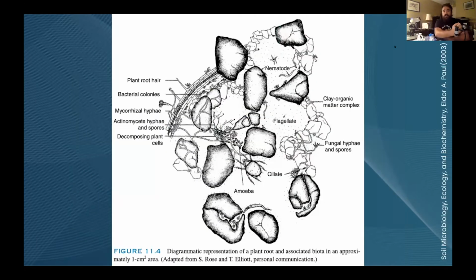So we understand it's very important. This is actually what soil structure should look like. You see a whole cast of characters, a micro ecosystem. Between plant roots, mycorrhizal fungi, saprotrophic fungi, bacteria, protozoa, microarthropods, and nematodes, the whole ecosystem is there.